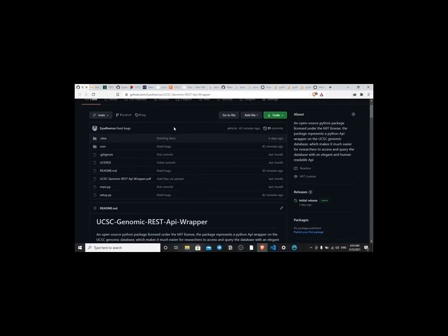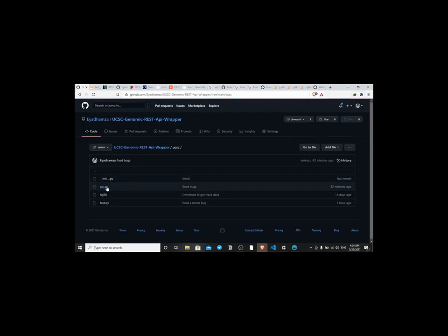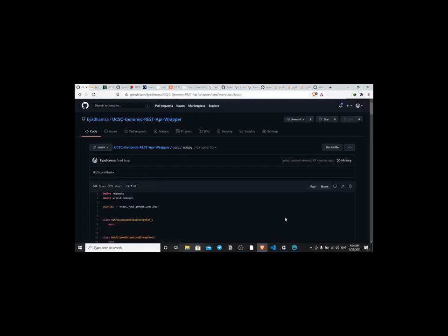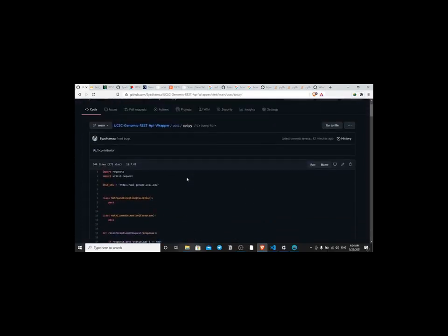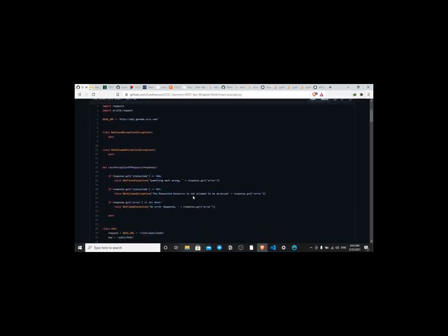Okay. Now, if we go to the folder UCSC, and if you go to api.py, of course, all the code lives in api.py. The other files are just to tell Python that this is a Python package, and this is just for testing. So api.py is our goal here. Okay. So now let's dive into the code under the hood and see if I can get the outlines clear and how the code flow works. If you want to extend the package later, this part of the video will help you indeed.